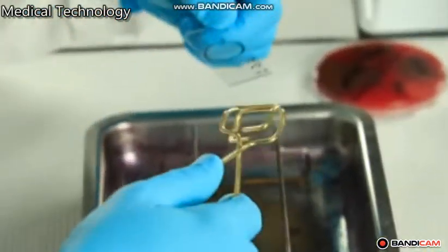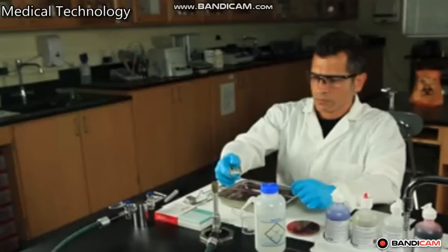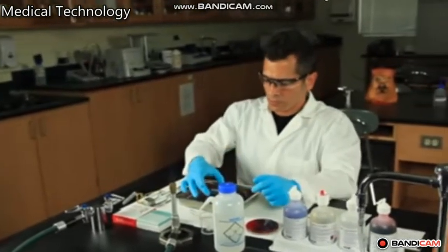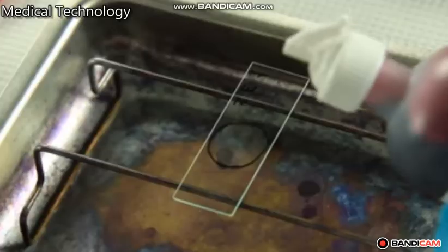After that, you must pass the bacteria 3 times through the flame of the Bunsen burner to fix and kill the bacteria.